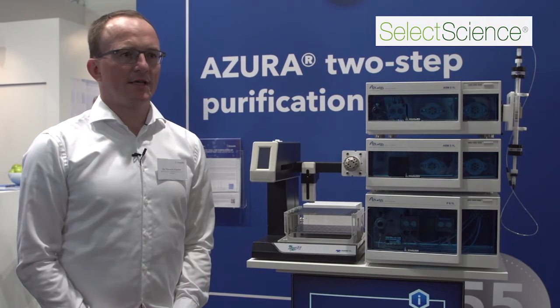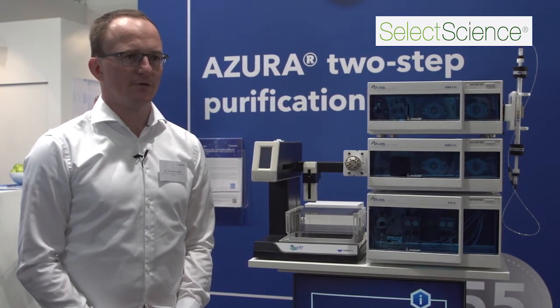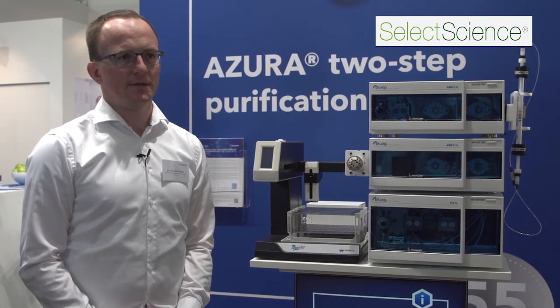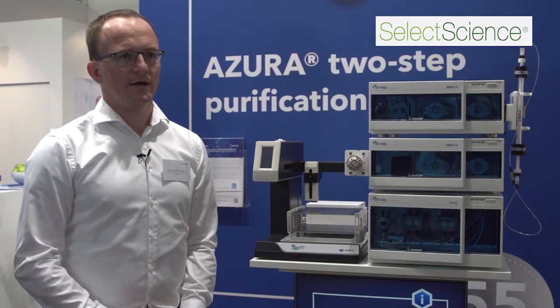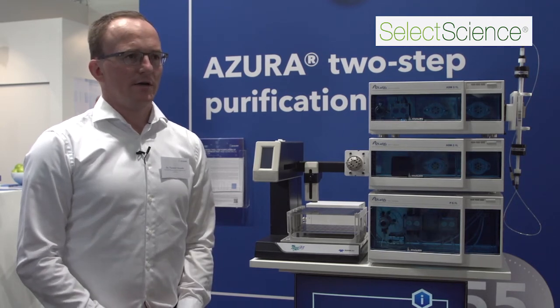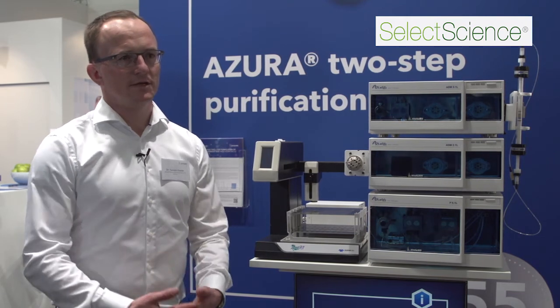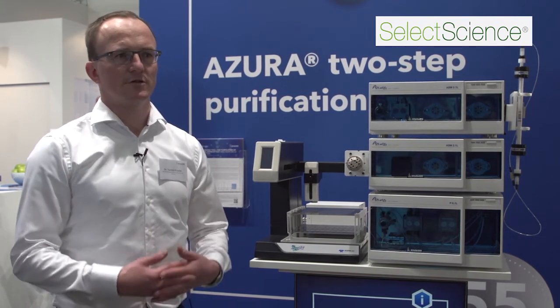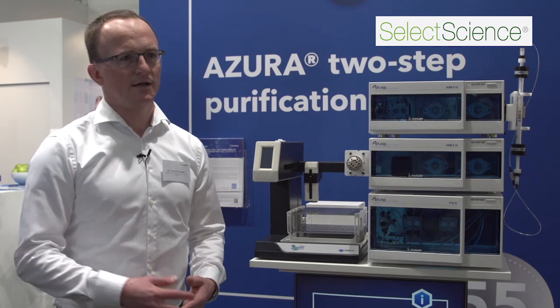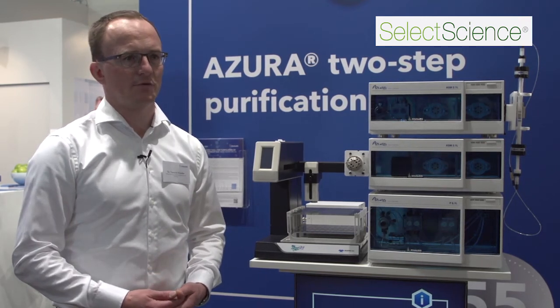The Azura two-step purification system will be used in a broad area of protein purification. Basically you will be able to purify any kind of protein such as recombinant proteins or antibodies. Of course the main interest is doing two or three purification steps, but you can also do single SEC or affinity separation processes.